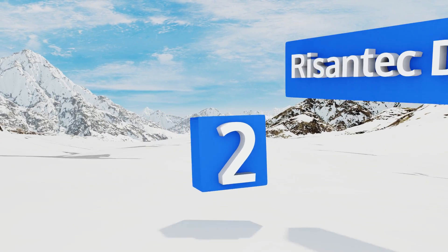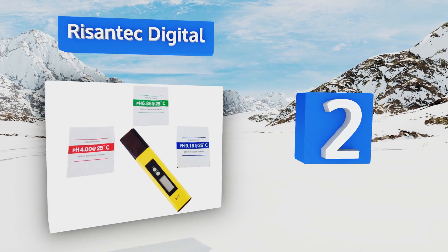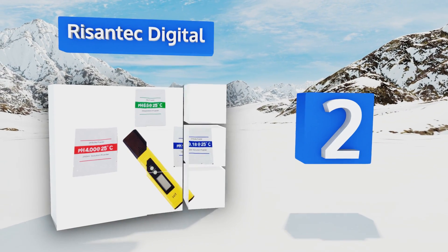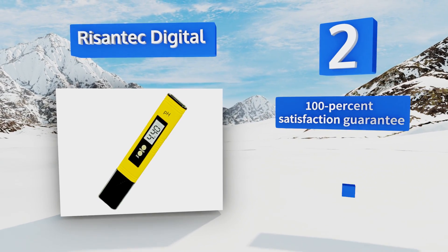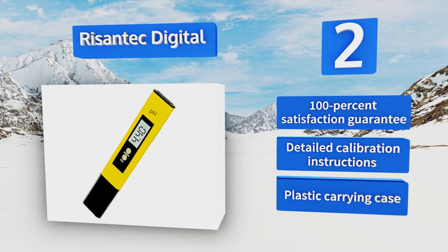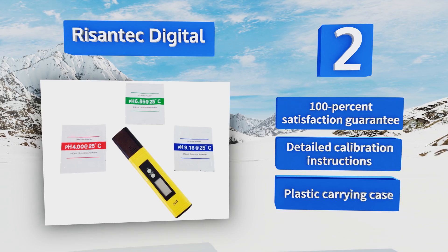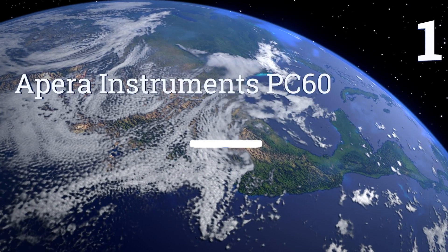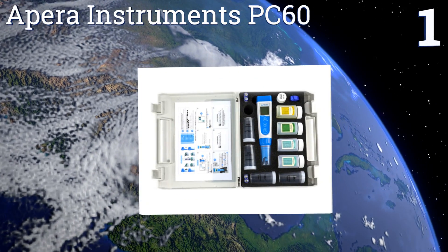At number two, the Rosantec Digital can be used with one hand for quick and convenient readings while you use the other to move covers and other things out of the way. It's low-priced, making it a good choice for kids' science projects too. It comes with a 100% satisfaction guarantee, detailed calibration instructions, and a plastic carrying case.